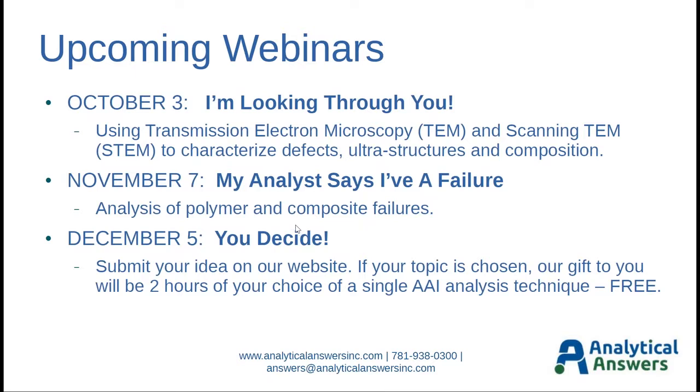The next question is, what tool do you use to do STEM? Well, the STEM data I showed was actually done on our in-house field emission SEM, and so that was done at 30 kV, and that probably accounts for some of the breadth of some of those EDS traces and why they weren't narrower. We do offer work done on a higher kV instrument, up to 200 kV, where you would get much narrower line scans because of less scattering of the beam within the material.